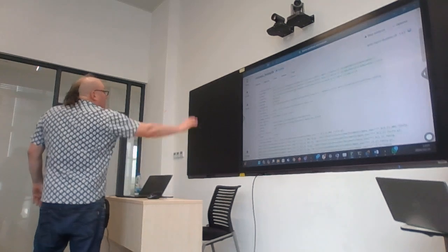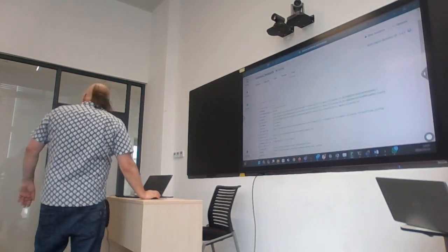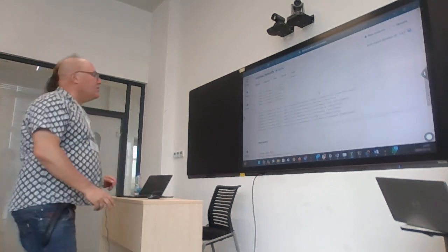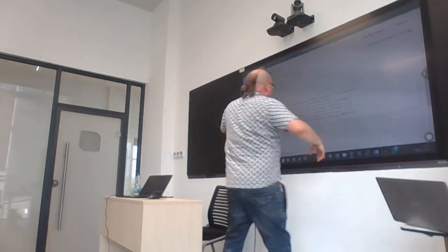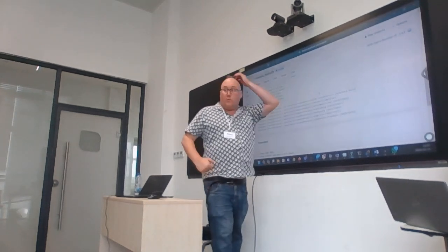You can see it starts off with the parameters that get set, and after the parameters it says submitted process. Here we can see in detail which things it's doing: submitted process, prepare reference, fetch hostile reference, etc.